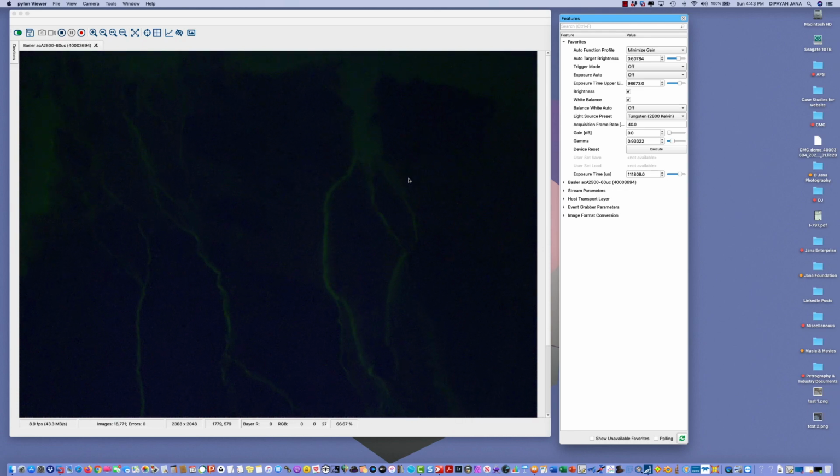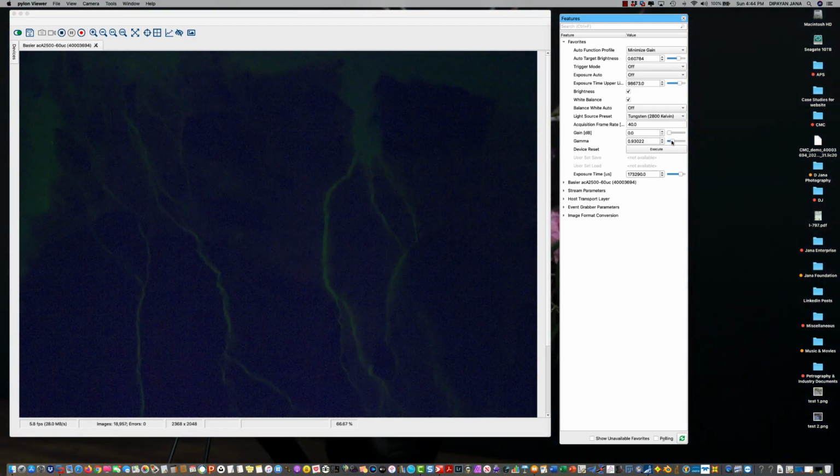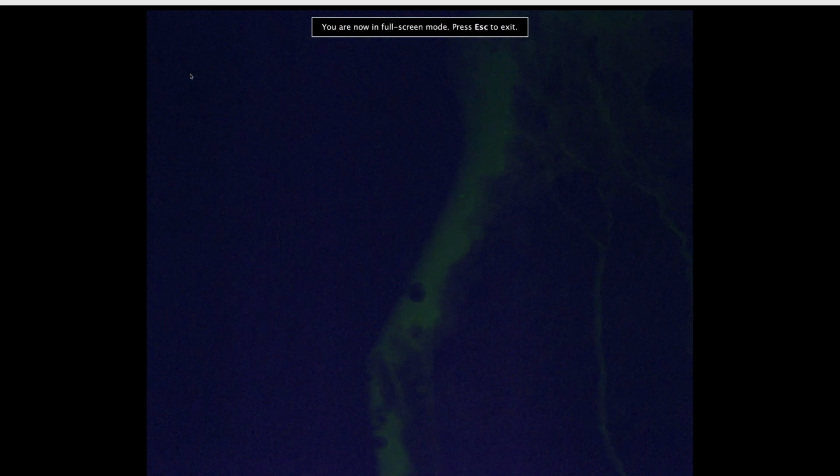Once we open the fluorescent filter, we turn off the light from the transmitted base, and we turn on the shutter to let the light come from the reflected attachment. Then we get the same feature in the fluorescent light mode. We play with the exposure time a little bit to get the feature, the crack, to highlight the cracks in the UV light.